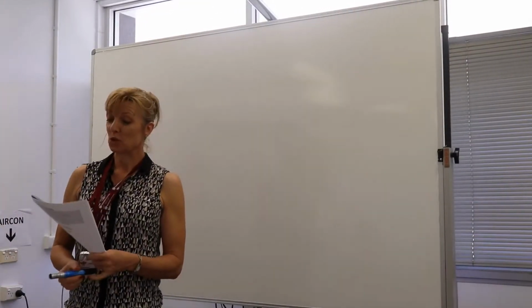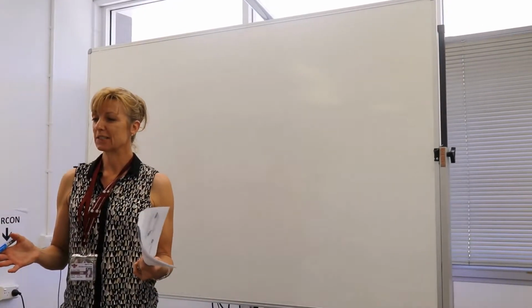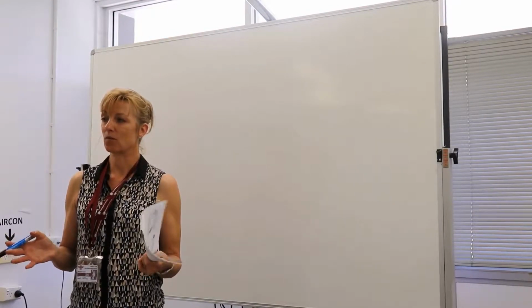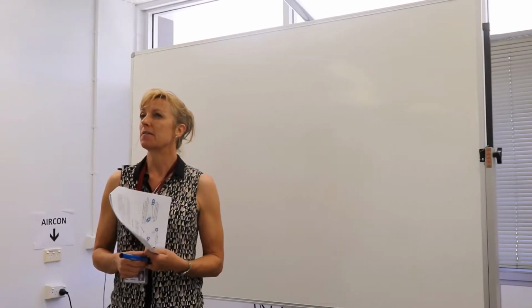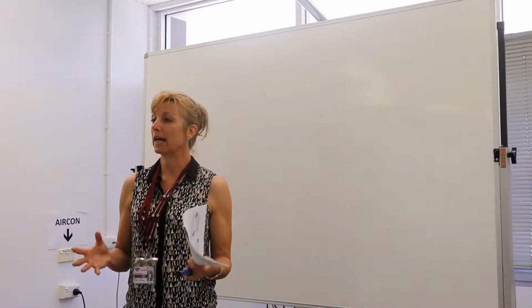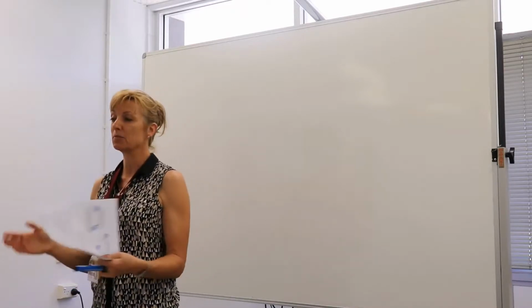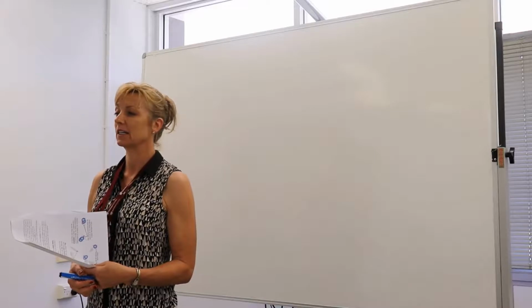This afternoon we're doing more on rates of reaction. This is your student experiment, so it's very important that you know quite a bit about how rate is measured. So some of the theory to explain why parameters affect rate, and those parameters are, what are they? What are the things that affect rates of reaction?